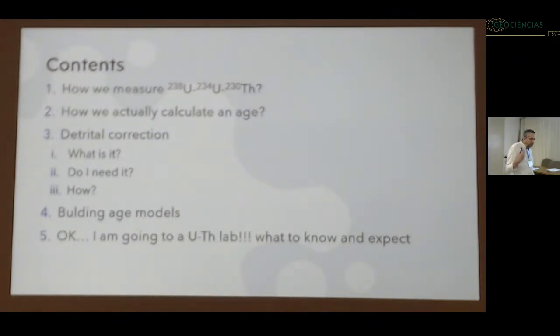And then we're going to be building some age models, which is also really good. This is an essential part of your work that usually, not always, but usually, is left in the supplemental material of your paper, so there's very little discussion of it. A lot of this comes from what I've learned from 20 years of doing uranium thorium dating. Sometimes it's difficult to understand the papers because they have to be very condensed, so I've tried to put it in an easier way to understand.